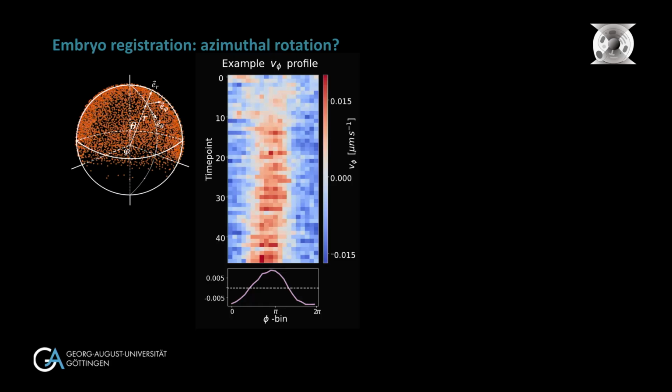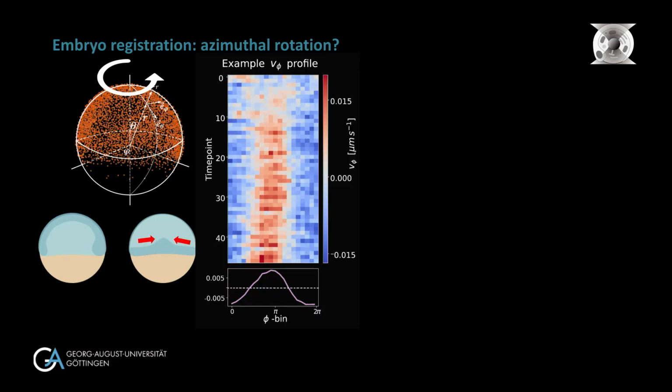And that was kind of neat. What Alejandro really showed here was that he was measuring now all the flows that are acting there. What you see here is basically, on this coordinate system, that azimuthal line. You can see that in a certain direction, the velocity flows are positive. That just means they go in this direction. And in other regions, they're negative. And what you can actually see is that there are regions where the system is converging. That's called the shield region. That means we have a switch from a positive, to the left or to the right, to a negative direction. And this is something you can also see here.